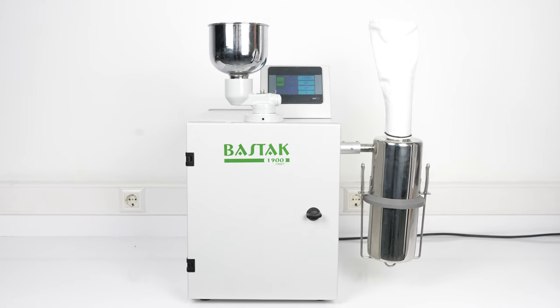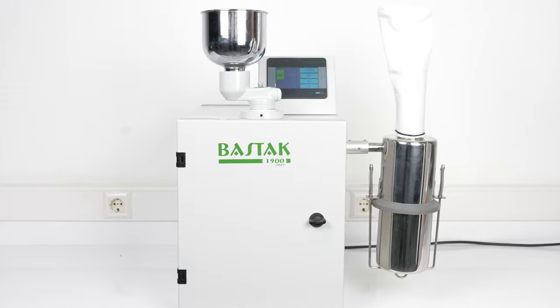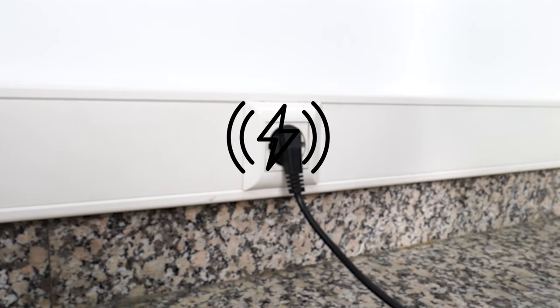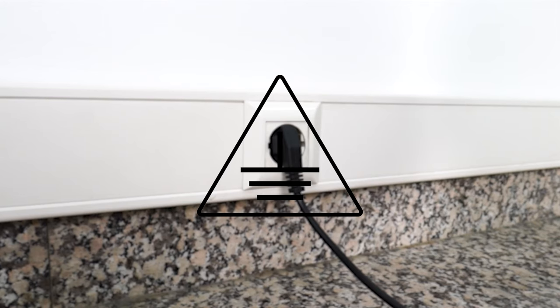The Bastak brand 1900 Smart Model Hammer Mill Device is placed on a flat and solid surface. The device is used at 220 volt and 50 hertz grounded mains voltage. The grounding of the laboratory where the device will be installed is measured. The grounding value should be less than or equal to 5 ohms; if not, the grounding line is drawn again.